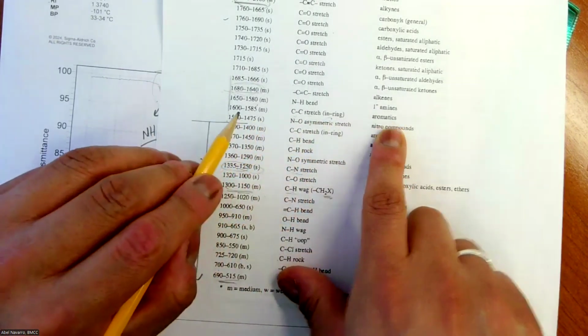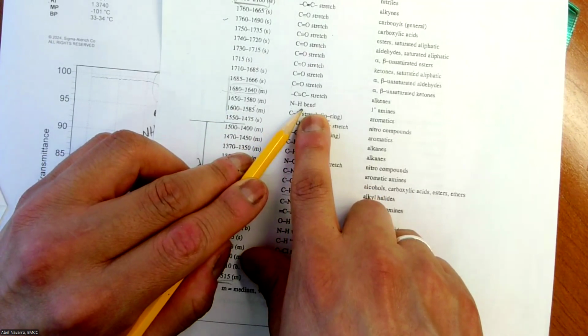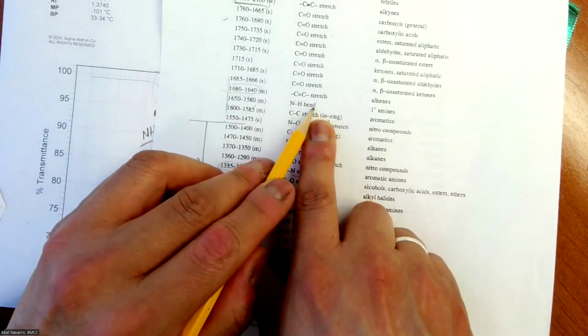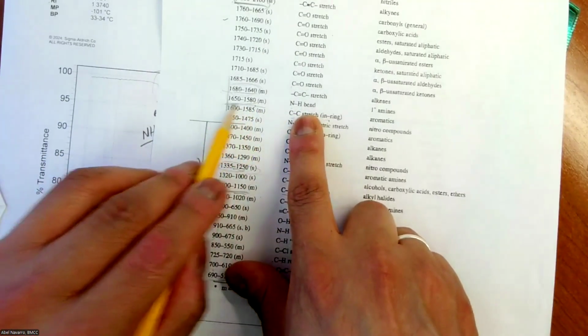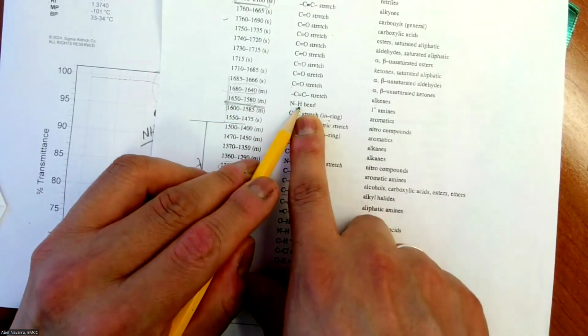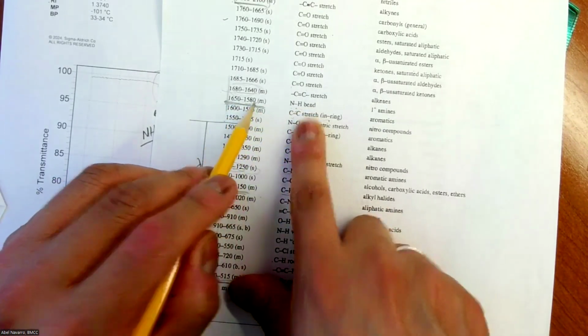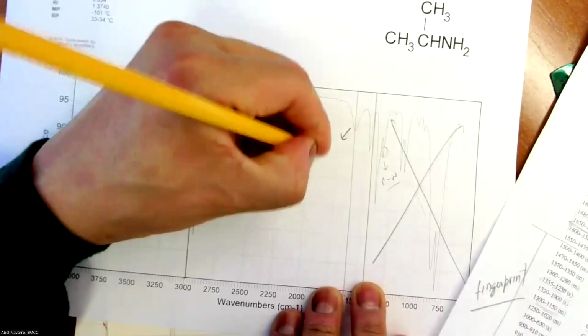No, that's not. Oh, look, NH bend. See, NH bend. Interesting, that's something I'm learning with you guys right now. So 1650 to 1580, that's exactly this one. That's also an NH. And then it tells me it's a medium intensity, right?